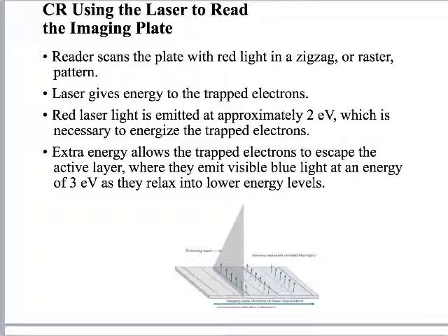Yeah, it would mess up my picture. What I'm trying to record is blue light coming off the crystal, so my laser has to be red, so that I can just capture the blue light. In essence, I'm going to use a camera that cannot see red light. It just sees blue light, because I'm only interested in the light coming off of the crystal.